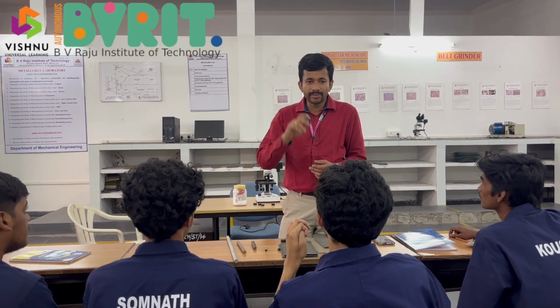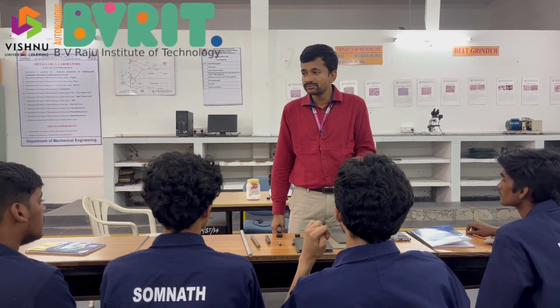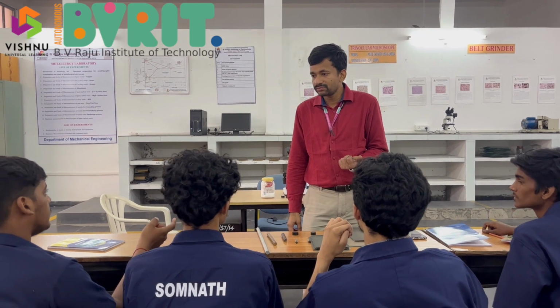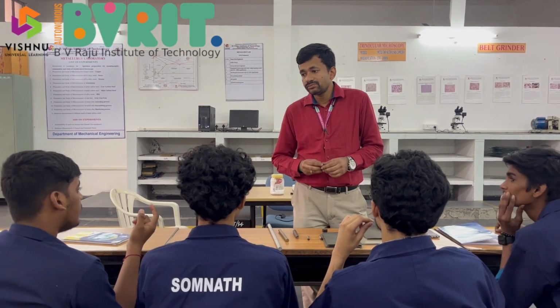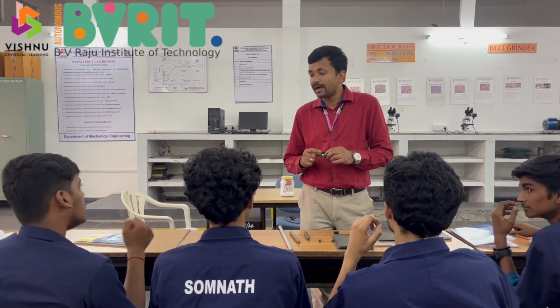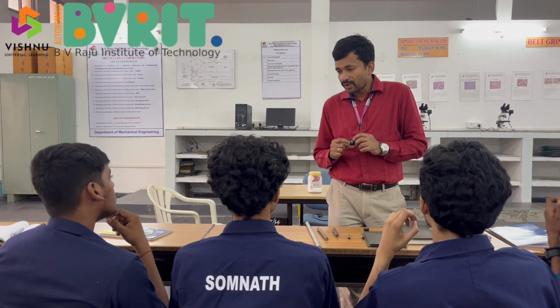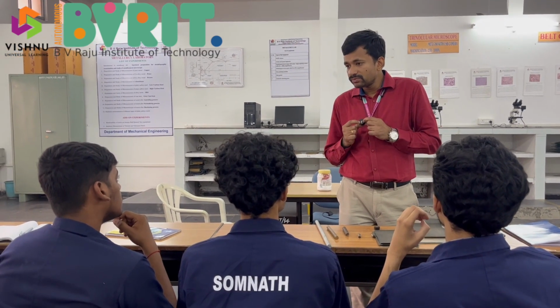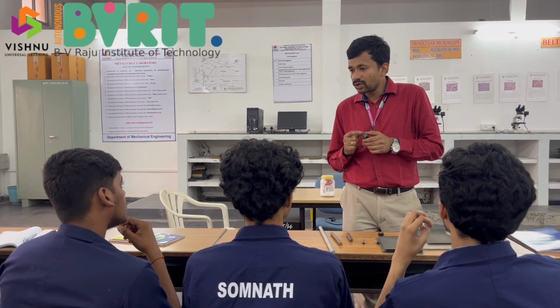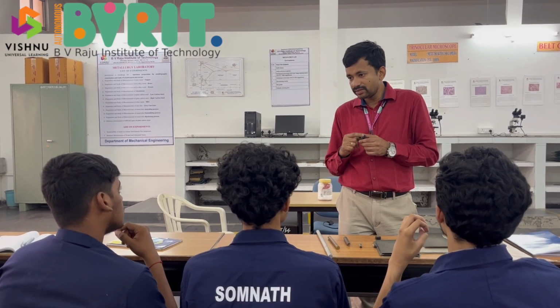Understood? That is about the specimen. That is about this process. Any doubts? Any more? So when the... which one? Backward. This will come, but it will not affect anything, because whatever is coming out will go away, and then your main focus will be on the metal.